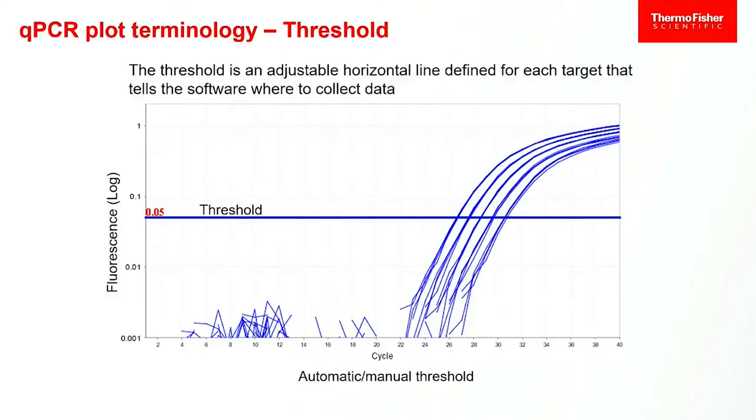So we have to really think about what we're doing and how we're talking about changes to make sure we're talking about them in the correct direction. When you're doing your data analysis, negative values, positive values, and sign changes can make a huge difference. So you do need to be careful. Excellent question. Thank you.